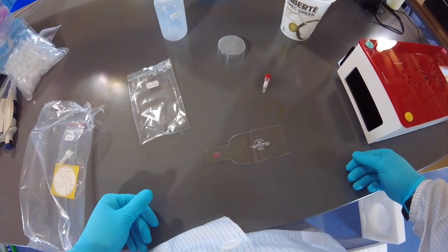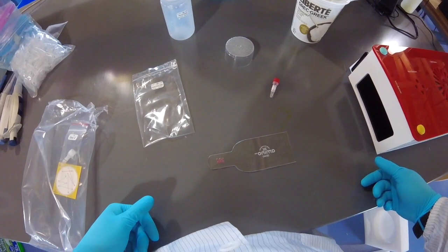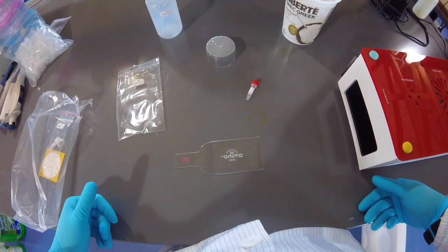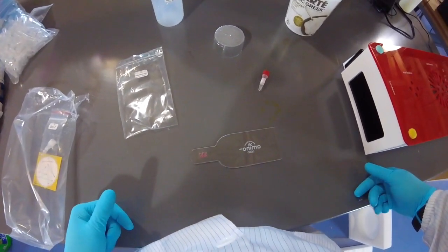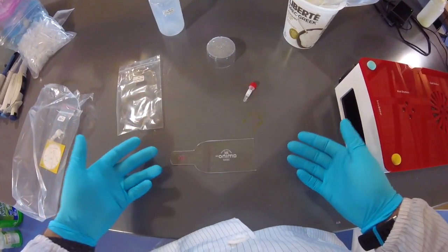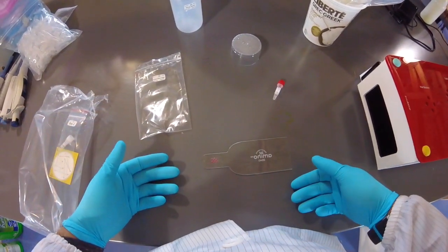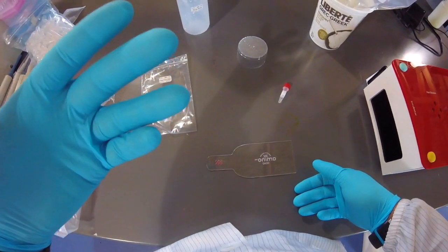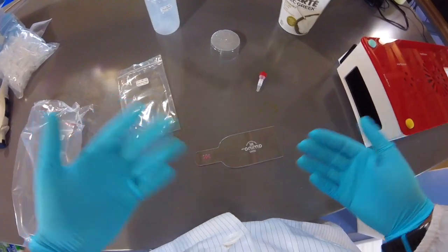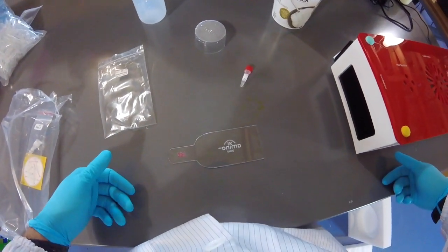On day 3, we took some other selective Petri dishes that we made and we streaked or spread out our engineered cells onto the experimental plate. All right, and then we incubated that about 20 hours ago. And then all the while we did 2 controls. We did a negative control where we put blank cells onto a selective plate. And this was to test whether the antibiotics actually work, right? Because the non-selective plate doesn't have antibiotics, and blank cells can grow on that, but can blank cells actually grow on the antibiotic plates? And we found that no, there was no growth, so that suggests the plates had antibiotics in them at the right level so that the cells couldn't grow.